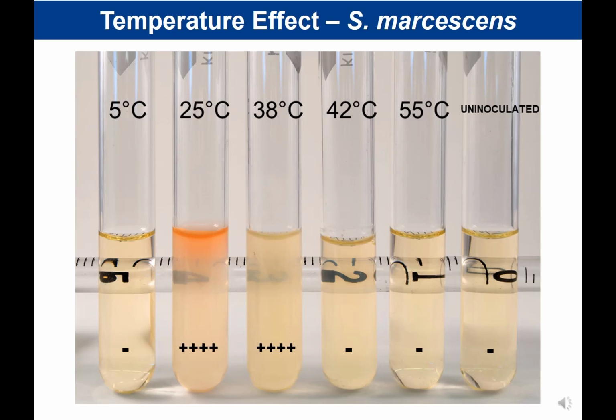And so again, you want to start thinking about what is the term for Serratia marcescens? Is it a psychrotroph? Is it a mesophile, etc.? And again, we'll come back to that in just a minute. But notice that for this one, it grew best at 25 and 38.